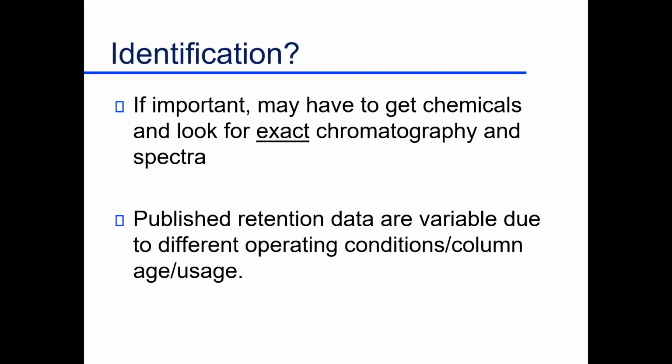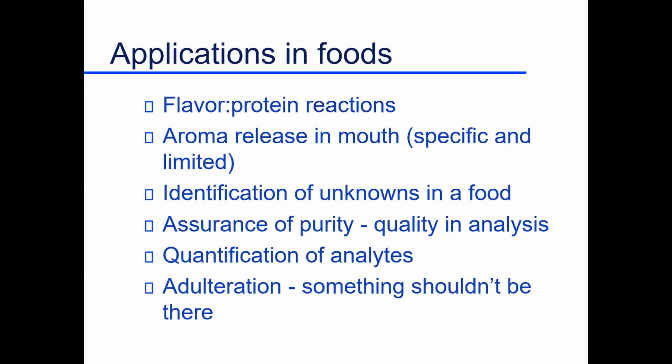Because gas chromatography is really good in terms of resolution. You can determine or separate most compounds using that technology. So again, I would look for co-chromatography on my system, the same system I got that spectrum on, and look for identification based on that. But I guess certainly my point is that you have to be careful. And again, I've said that many times. Machines put out numbers, they don't tell you which one's correct.